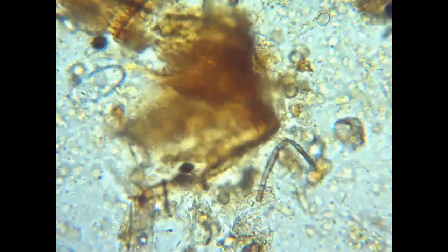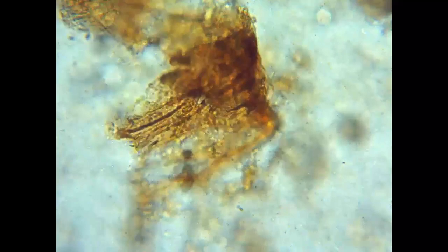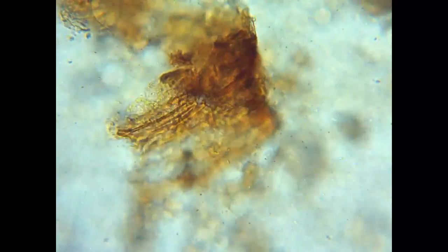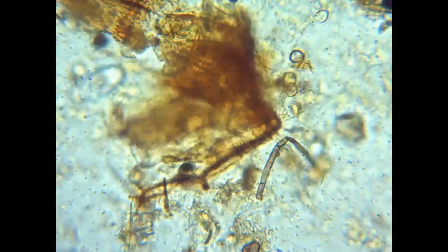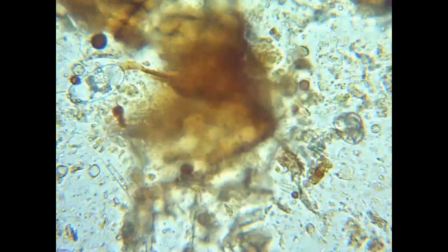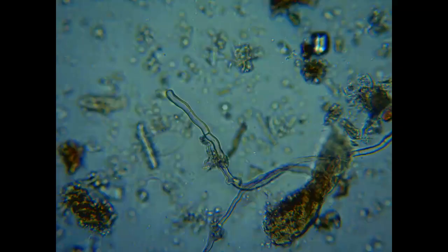One of the things you'll be looking out for is fungi. You can identify fungi because they look almost like tubes under the microscope. You can tell it's fungi because all along a single strand, it's going to be the same thickness. If you see something that looks like fungi but it tapers down, that's not fungi. They could have branches, and those branches don't necessarily have to be the same thickness as the original strand, but anything along a single strand will be the same thickness.